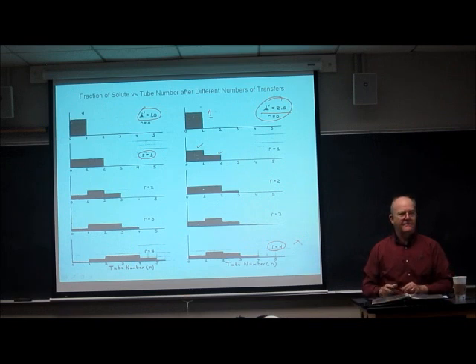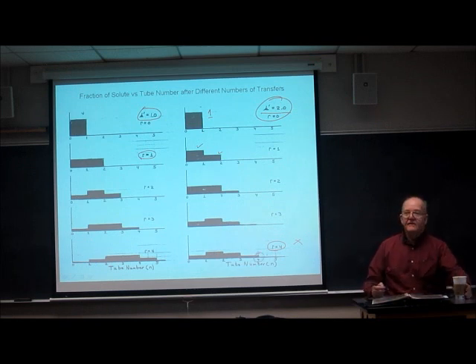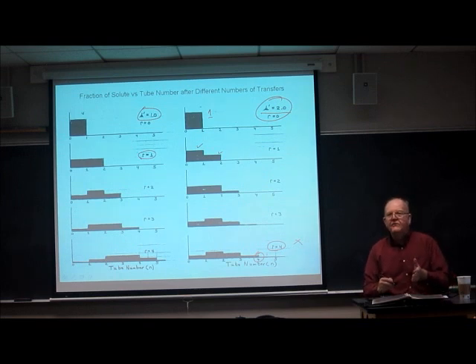There's a separation. Now, this doesn't look like a great separation because the Craig machine doesn't have that many plates. We've only occupied 4 plates. I've never seen a chromatographic column that had 4 plates. If you buy an even semi-decent HPLC column, 5 centimeters long, it's got at least 5,000 plates on it, or you send it back to the manufacturer. A decent capillary GC column that's, say, 20 meters long has got easily 15, 20,000 plates on it. So this doesn't really look that good yet, but the basic principle of the separation is here.